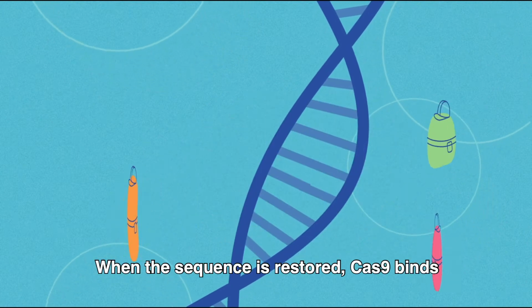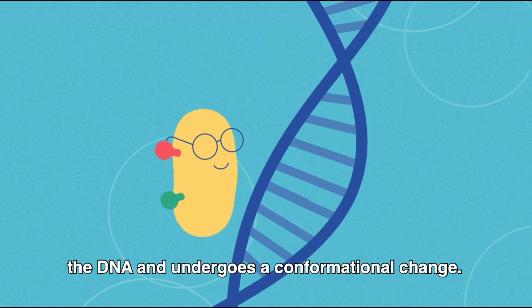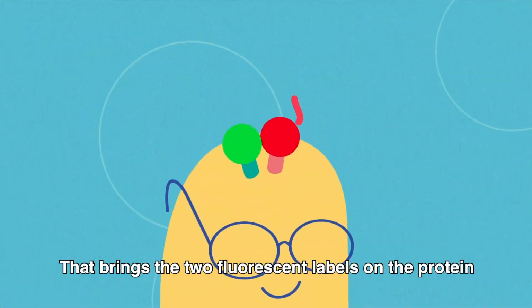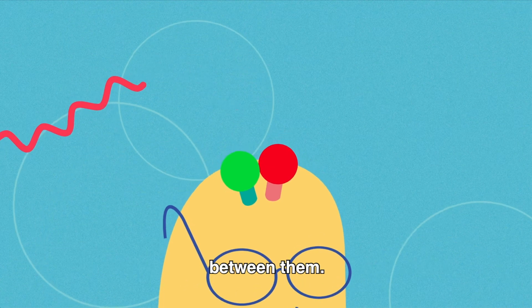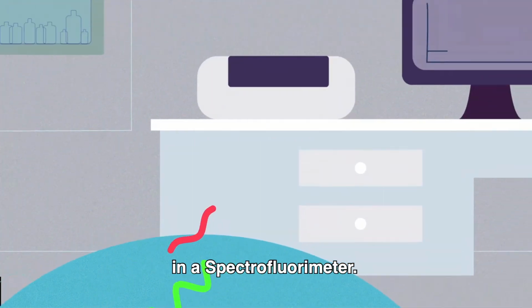When the sequence is restored, Cas9 binds the DNA and undergoes conformational change. That brings the two fluorescent labels on the protein in close proximity and leads to energy transfer between them. This FRET signal can be recorded in a spectrofluorometer.